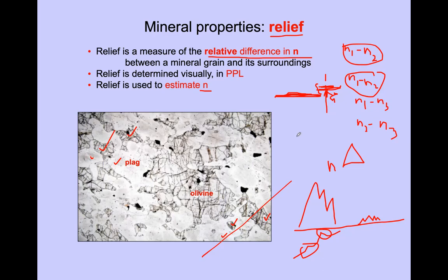The refractive index of glass is 1.5. So this glue will also have a refractive index of 1.5. So there will be no harm for the light passing through that glue. It will behave like the glass itself, right? So this is very, very crucial in selecting this glue, because that's why you have prescribed glues to use.